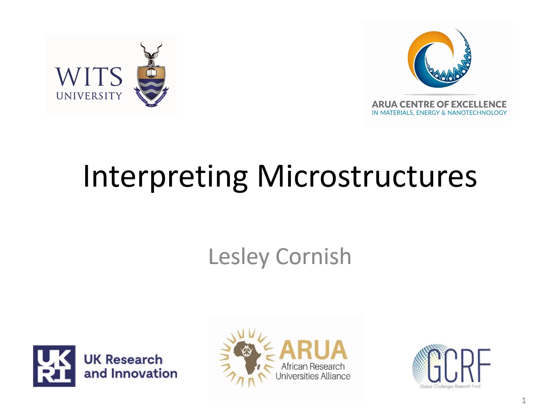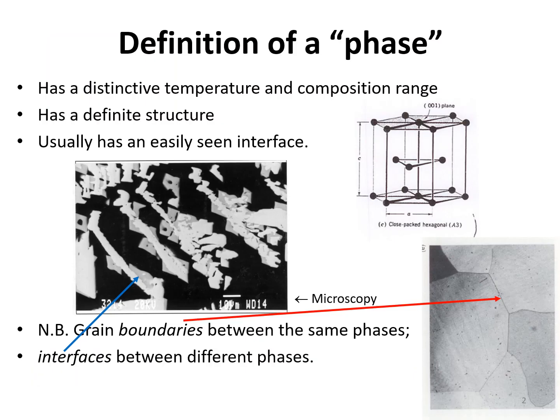Hello everybody. What this talk is about is interpreting microstructures. Now you can look up in books or online if it's a well-known structure, a well-known alloy, but if it's not, it's sometimes helpful to be able to interpret things and work out what's going on, and then you would maybe analyze it to find out what the phases are. So let's go ahead. First of all, we have to know what a phase is.